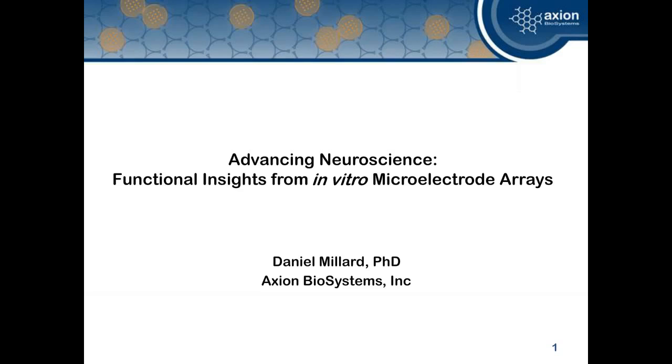I would now like to introduce today's speakers. Dr. Daniel Millard is an application scientist at Axion BioSystems. He will provide a brief introduction to MEA technology and the Maestro platform. Next, Dr. Carol Marchetto from the Salk Institute will speak about using the Maestro to explore network-level signaling in an in vitro autism model. Then Dr. John Graef from Bristol-Myers Squibb will present on pain modeling using dorsal root ganglion neurons. I will now turn it over to Dr. Daniel Millard for an introduction to MEA technology and the Maestro platform.